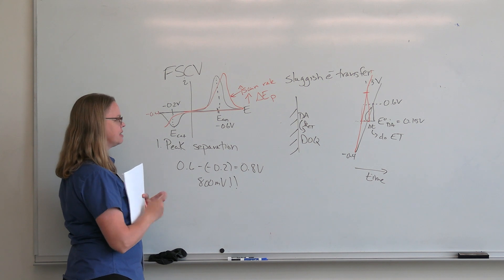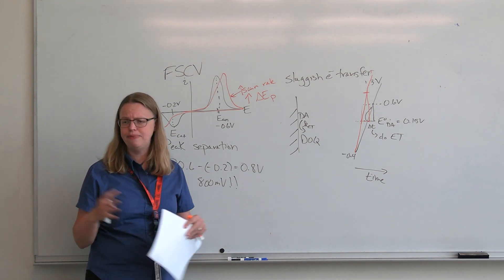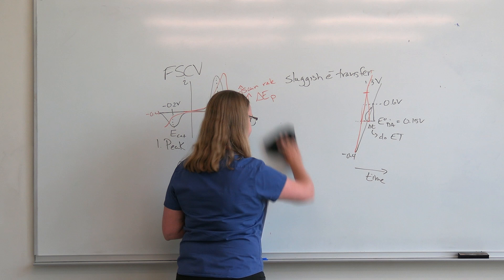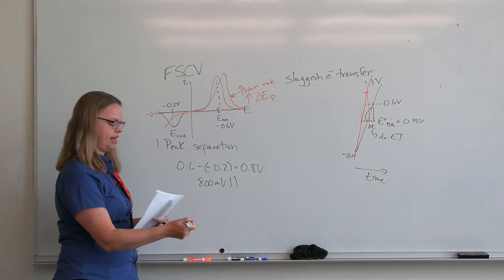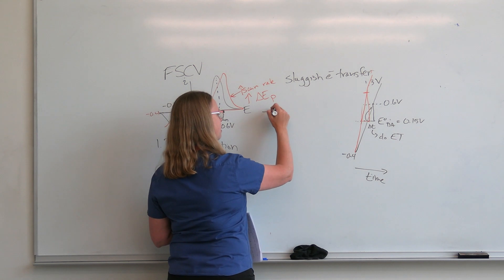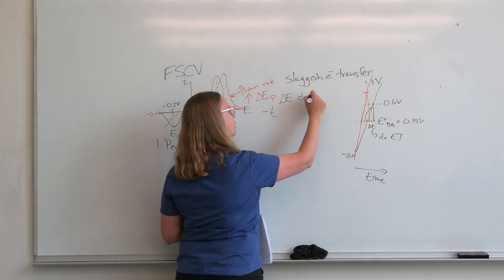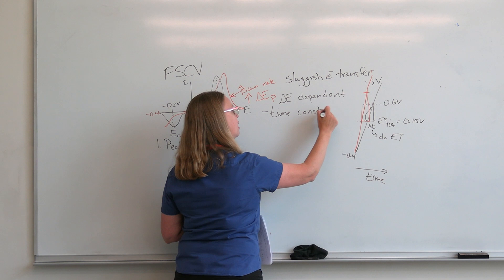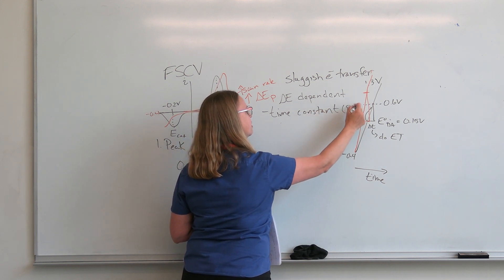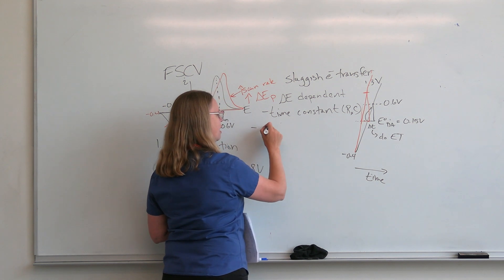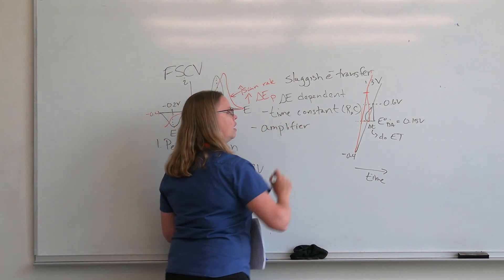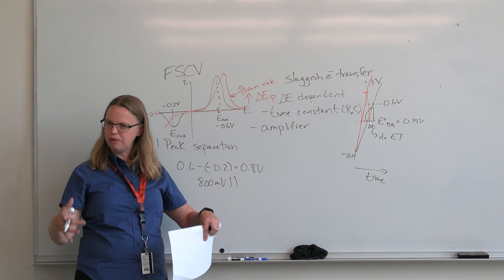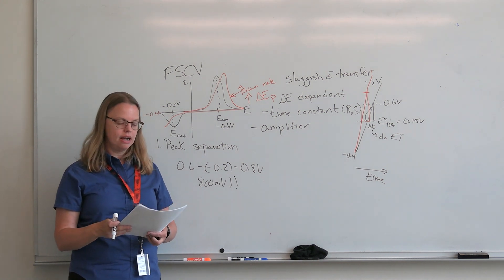When we wrote a paper about this, the reviewers noted there are many more causes of peak shifting. So all of these delta E peak values are dependent on a lot of things. The time constant of your reactions — that's the R and C — is one factor. It's also dependent on your amplifier: filtering settings or the bandwidth of your amplifier can come into play, and if it's not properly designed, that could cause peak shifting.